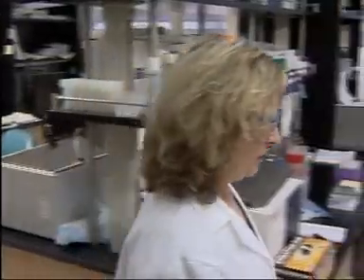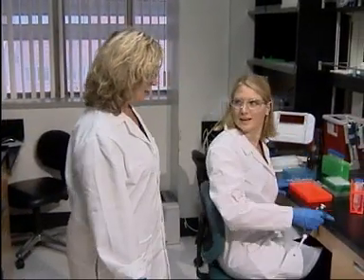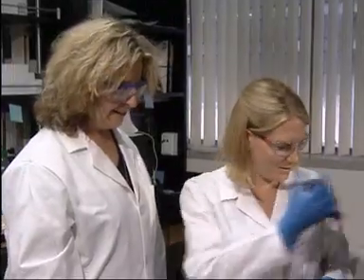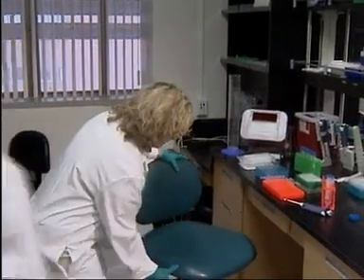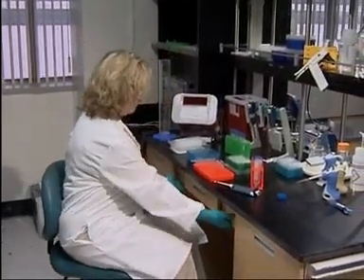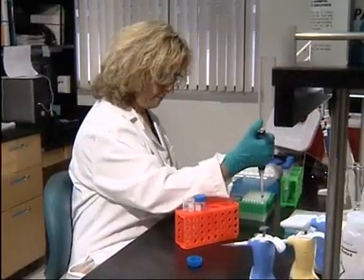Whenever possible, rotate pipetting tasks with other co-workers or intersperse other tasks in your routine. Try to limit continuous pipetting to 20 minutes. If you have to work for longer periods, take 3 to 5 minute micro-breaks every 20 to 30 minutes. Try to utilize gentle hand, arm and shoulder stretches during these breaks.